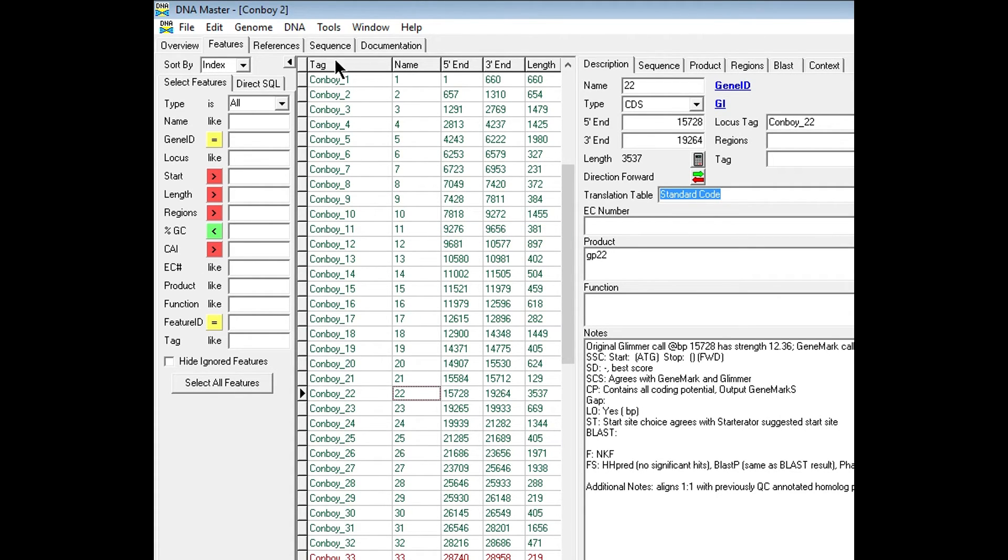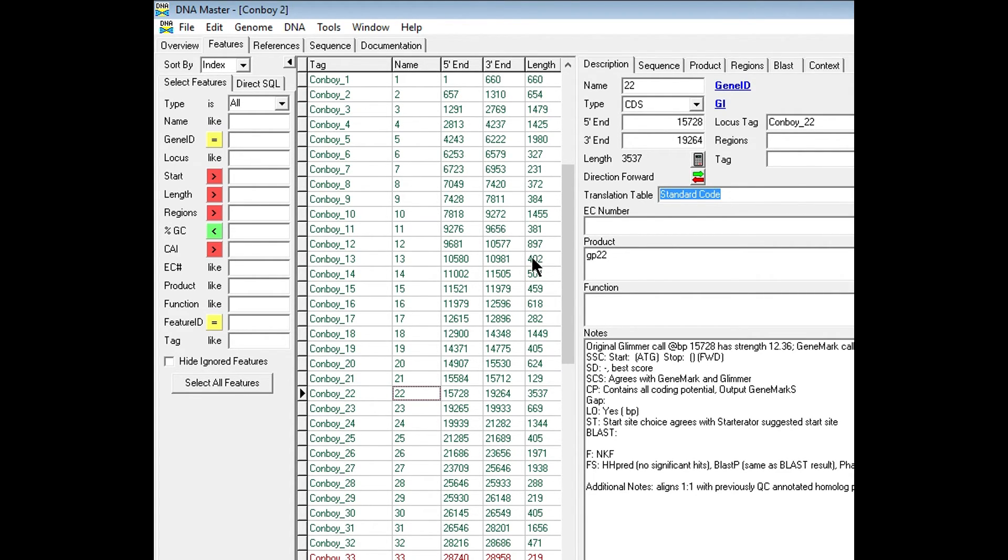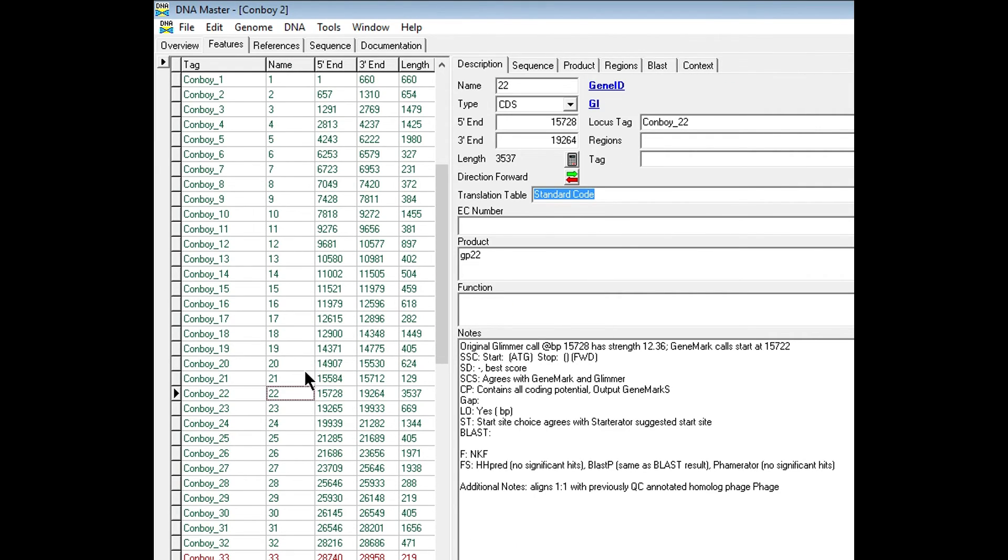This will give you the name of the gene, the number, the start site, stop site, and the length. You can also hit this arrow to take that little toolbar away and your window will now look like this.